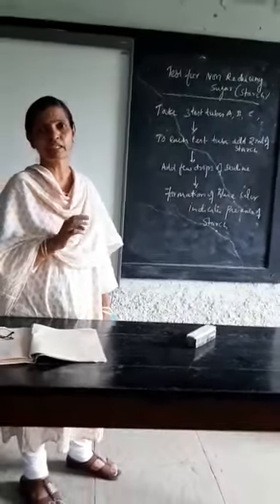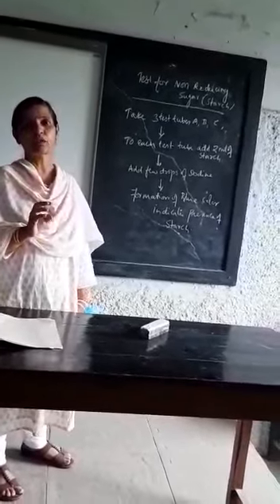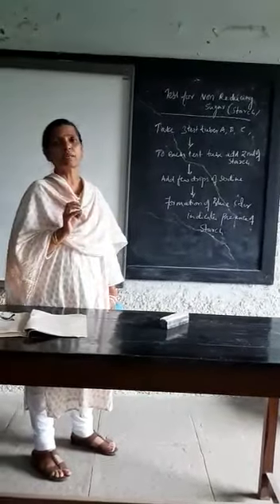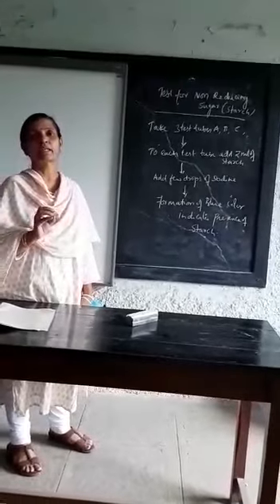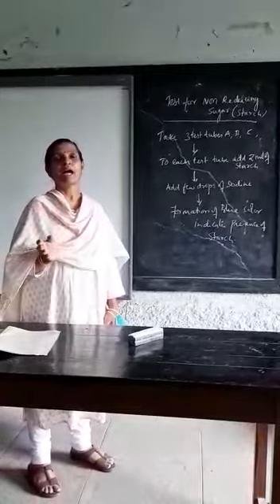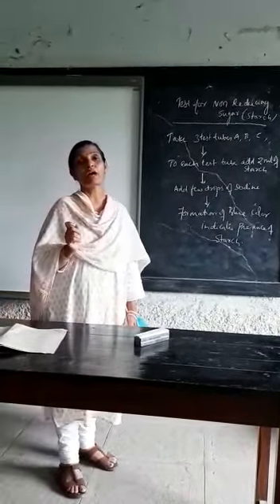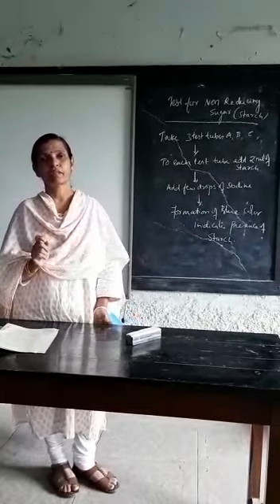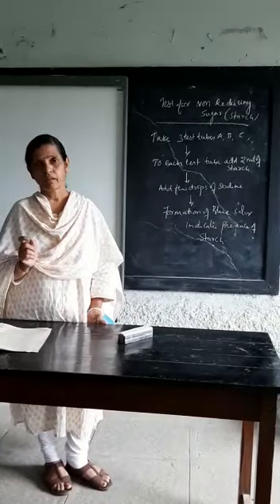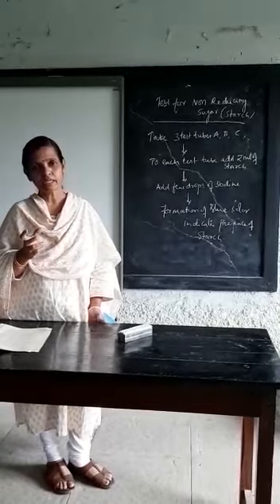I am here mentioning it as a starch solution, but in the exam we will not mention it. We will say it only as sample A, sample B and sample C. And these 2 ml of samples are taken in test tubes A, B, C. After taking the sample solution, we will add a few drops of iodine in each test tube. Once you add the iodine, mix well the sample and see the change in the color.